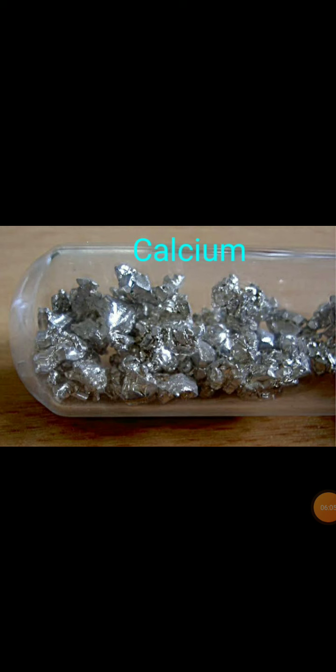Now calcium starts floating. Why? Because the bubbles of hydrogen gas formed stick to the surface of the metal. The hydrogen gas which is formed in the reaction of calcium and water sticks to the surface of the metal as bubbles, and that is why calcium starts floating.